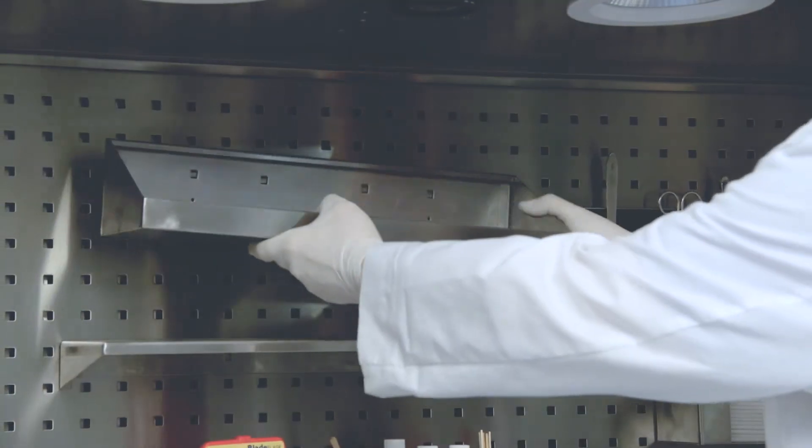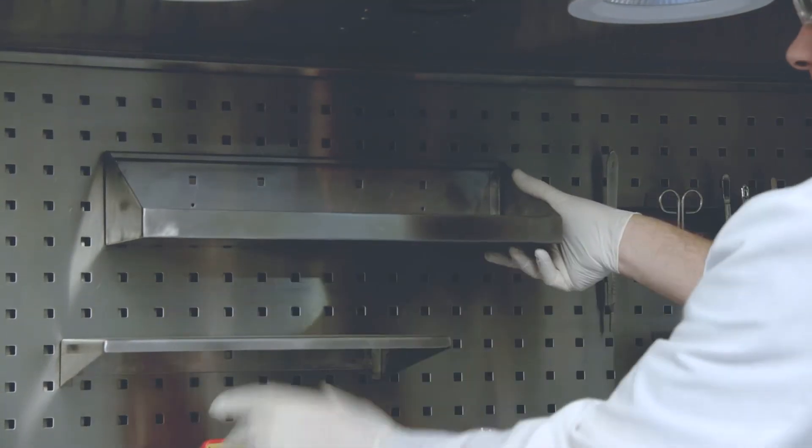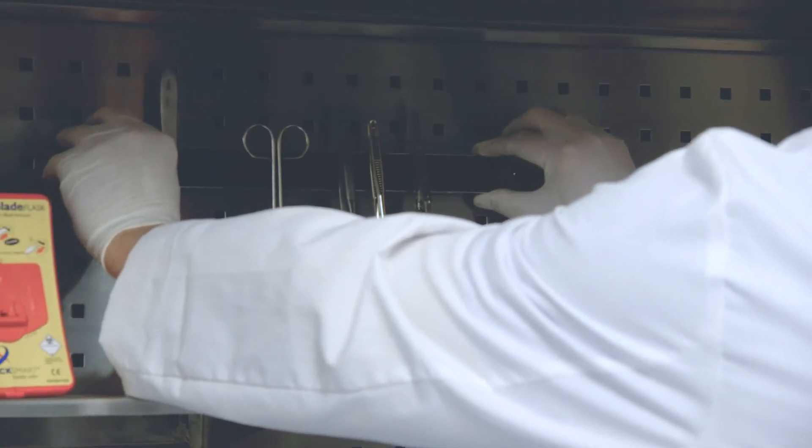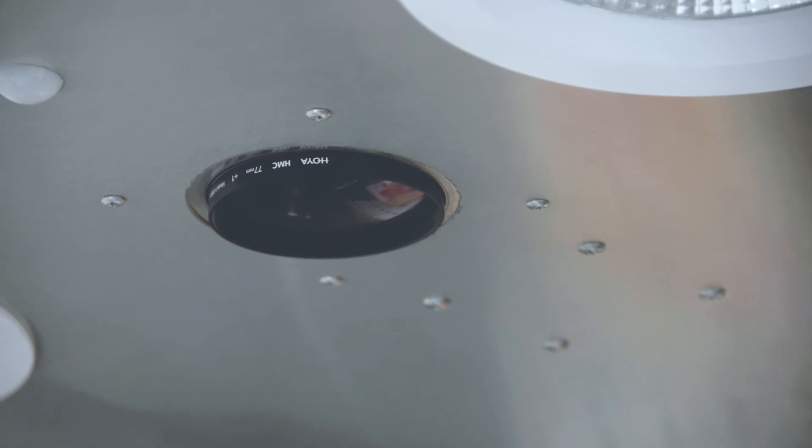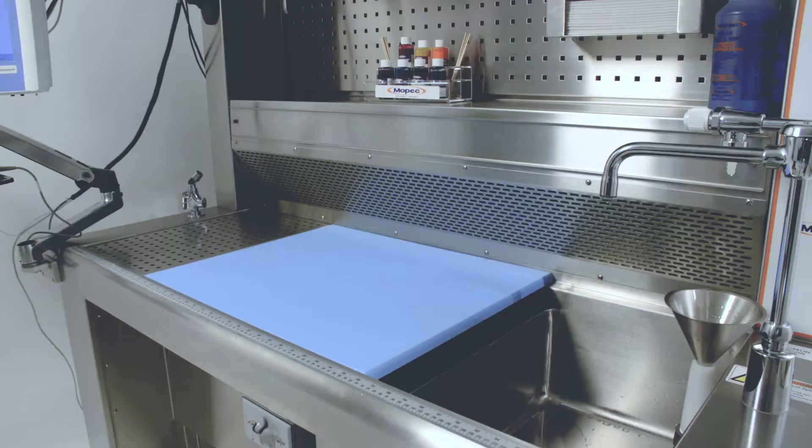Optional accessories allow each workstation to be tailored to individual grossing practices. The MB-800 is the first workstation designed with an optional integrated imaging system to streamline documenting specimens.